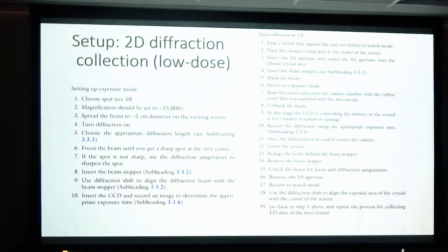You then have to set up exposure mode, and you set up to a fairly low mag, say 15,000x or something, so that you're covering a good part of the crystal. And then you go to diffraction mode, and then you have to adjust things, which I'll describe a little bit later, so that the diffraction mode is the way you want it.